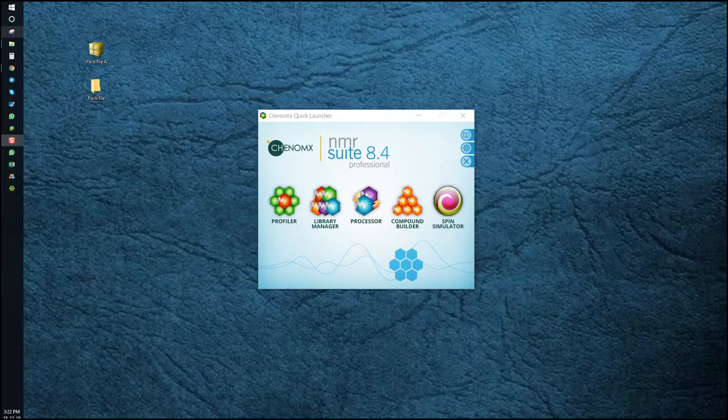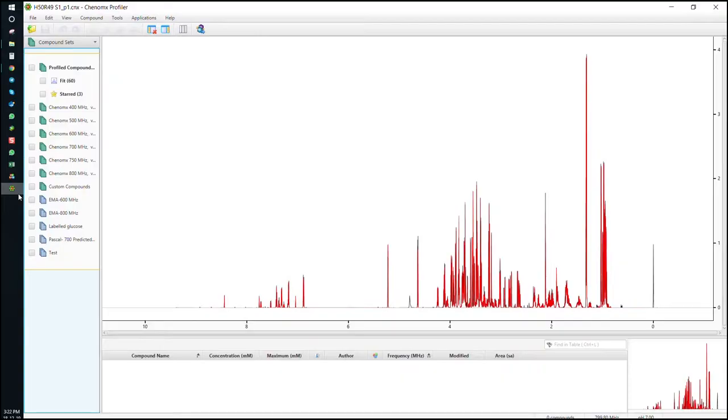First let's make a PAC file from a group of CNX files in the profiler module. As you can see we already have 60 profile metabolites which are stored in the fit folder in the upper left.